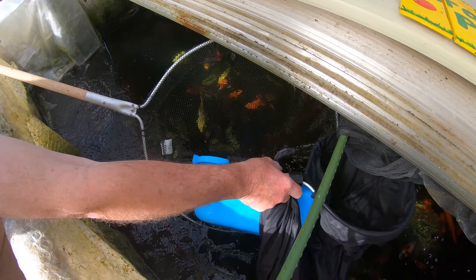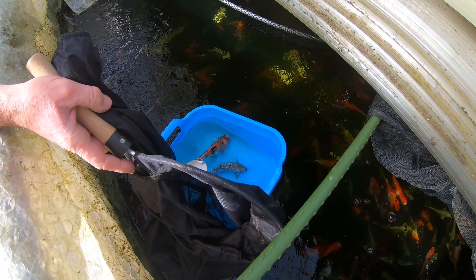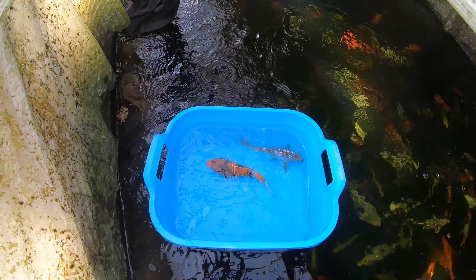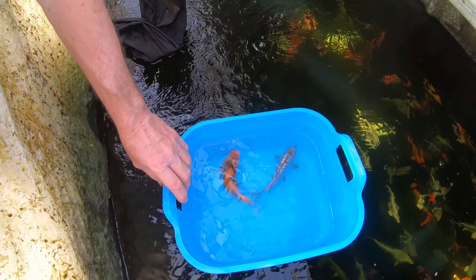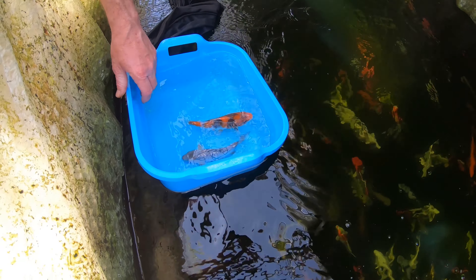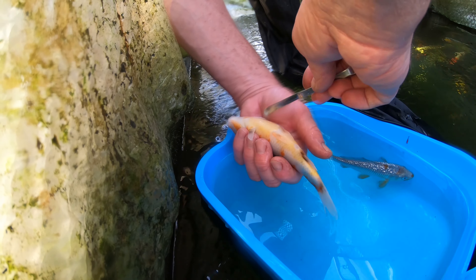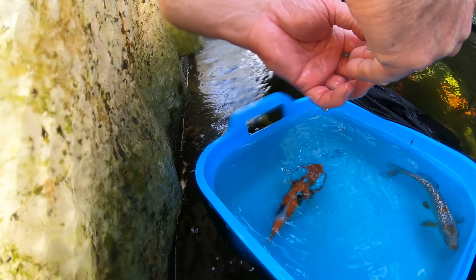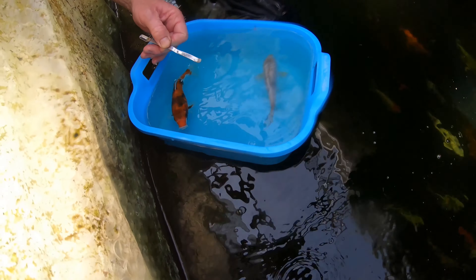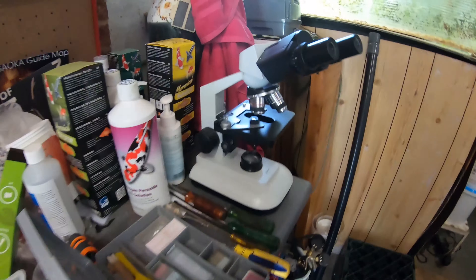Here we've got two fish going straight into the bowl — one I believe is a showa and the other one looks like a soragoi. We will take one of the fish, flip it upside down to disorientate it. This means the fish doesn't struggle too much and we can safely and comfortably take a scrape. We just rub down the belly of the fish behind the pectoral fins and under the anal fins to get a nice scrape of mucus sample. You can see we've got that cloudy mucus sample on the metal scraper.